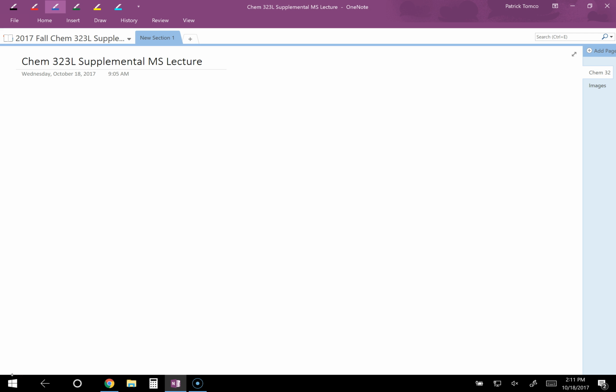This is a supplemental lecture on techniques in interpreting mass spectroscopy. I want to provide a couple examples of how mass spec fragmentation data can be interpreted, and this should hopefully be useful for you as you start to interpret your own data.